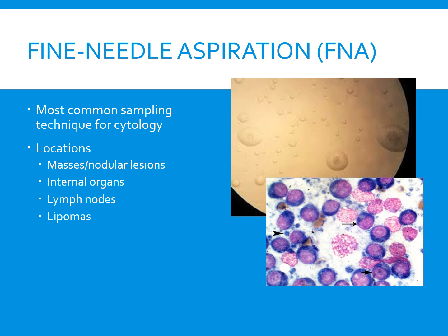Preparation for fine needle biopsy is going to depend on where you're sampling from and how much you're going to need. So for example, if you're doing abdominal centesis, you're going to have to be much more sterile, or if you're going in a joint, you're going to have to do a sterile prep. Whereas if you're just sampling a small amount of cells from a lipoma, for example, you can swab it or clean it with alcohol. And also there are some instances where you wouldn't want to clean the area because we're trying to diagnose something that we don't want to wash away.